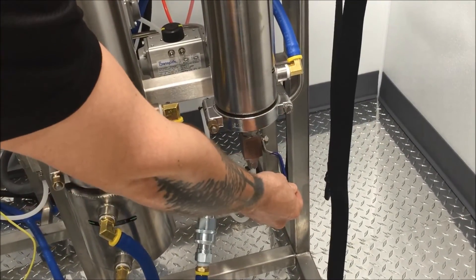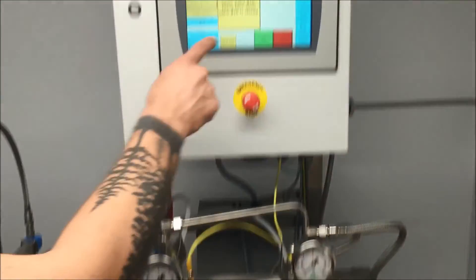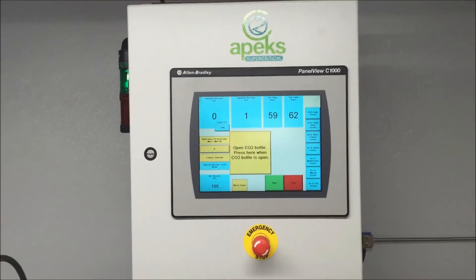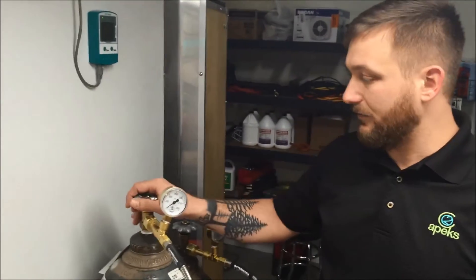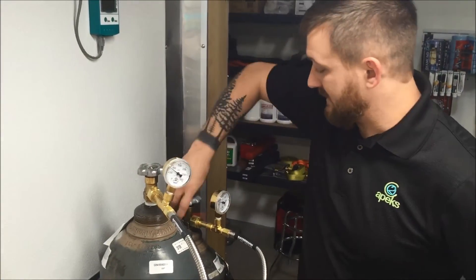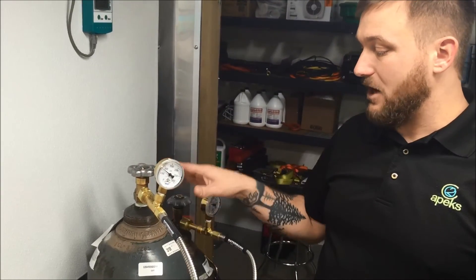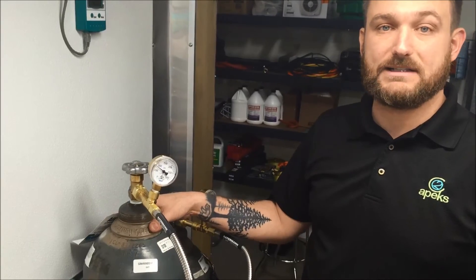We acknowledge, then it tells us to open our CO2 bottles. Our CO2 bottles are mounted over here — we're going to open them both up. This is instrument grade CO2 or medical grade CO2, which works really well for performing extractions. We know that the bottles are cleaned every time, which is why we're using instrument grade or medical grade CO2.